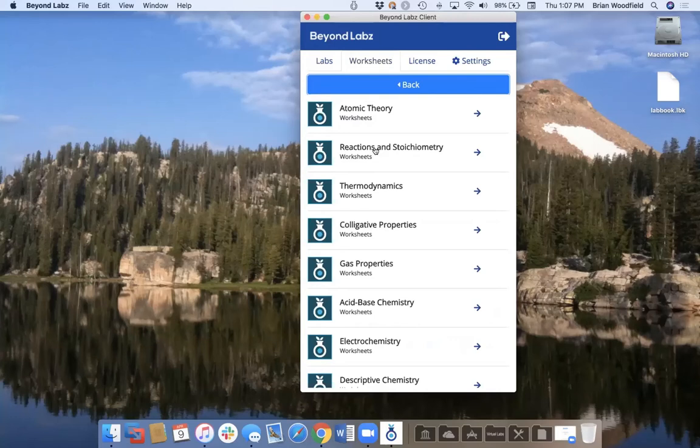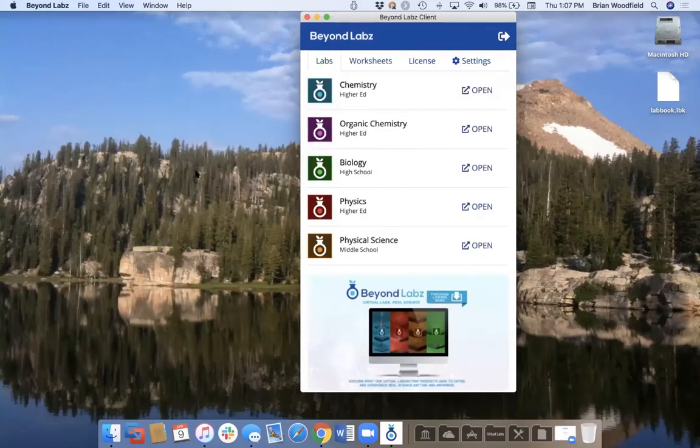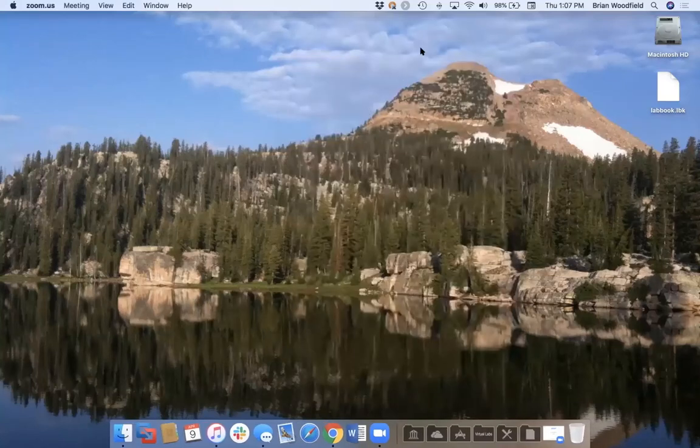So in that, like cation qualitative analysis or the ones that you had on the inorganic side, if you were coming up with all the colors and everything in case we mix different combinations, can we look them up on your resources, like what reactions or what particular compounds generate those colors, or we don't have access to that?